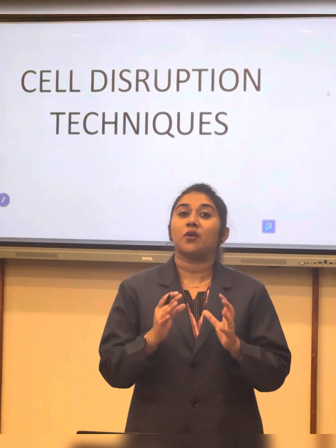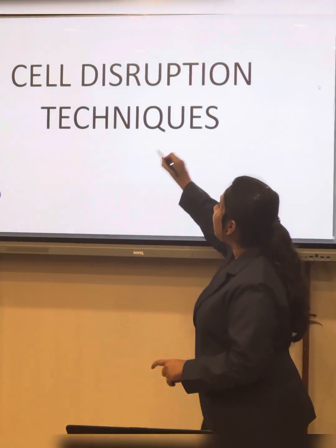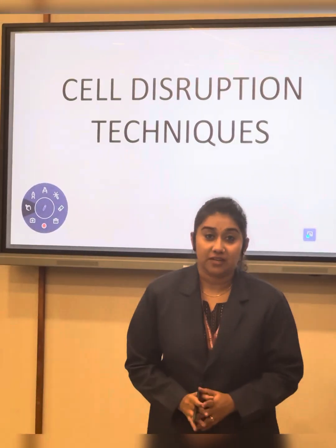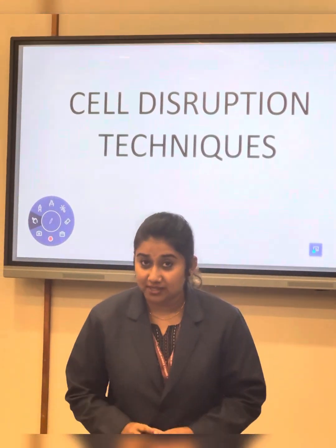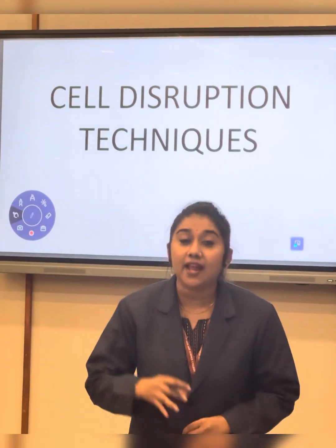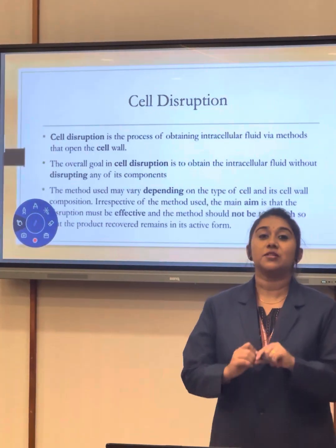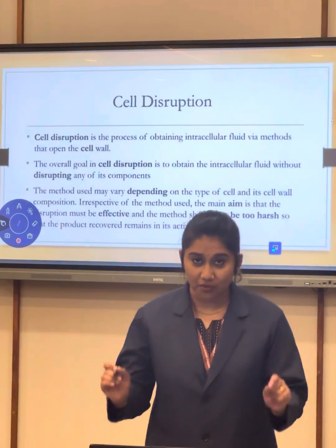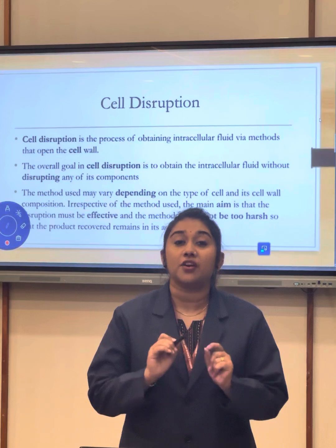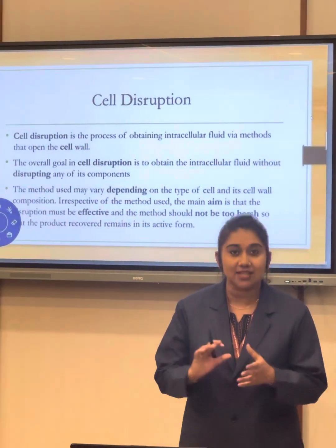Everyone, today we are going to discuss an interesting topic, that is cell disruption. What do you mean by cell disruption? It means disrupting the cells to obtain intracellular fluids or proteins. In the cell disruption process, we are disrupting the cell walls, but we are not disrupting any other components present in the cells.